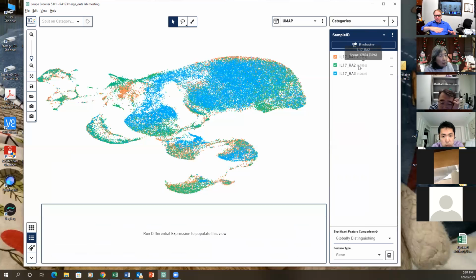No, but she can do it. Is the knockout and wild type? No, not here. I don't see it. What, you want to separate them out? You put them side by side. Each one is 2 mice per mix. Right. So you need to separate. This is mainly coming from number 2 sample. This green makes up most of these. Is that right?